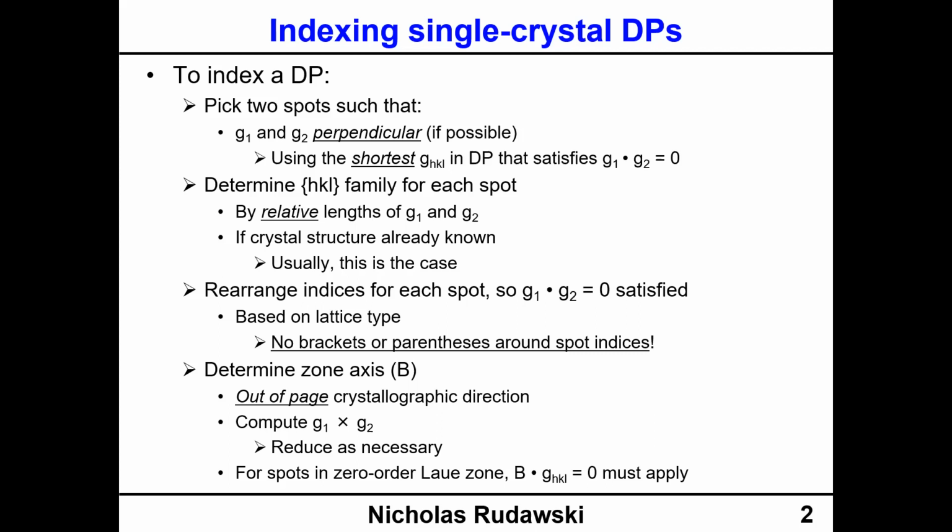Now I know there's a bunch of you out there right now that are probably saying, well, what if I don't know the crystal structure? It's very, very unlikely that you are going to be dealing with a scenario where you don't know what the structure is ahead of time, or you don't at least have some educated guesses as to what the structure is. Very unlikely you're going to be in a scenario like that.